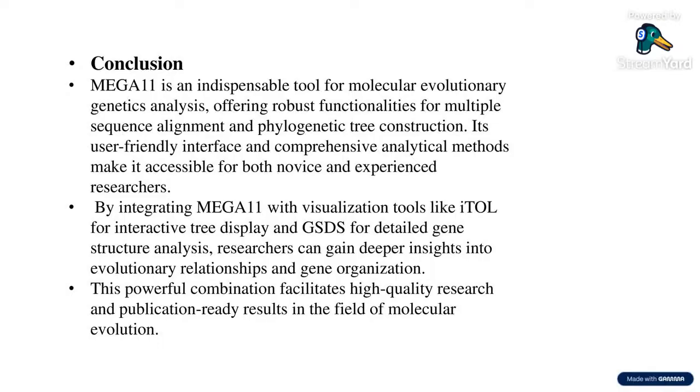So here is a question: Can Mega 11 perform codon-based evolutionary analysis?